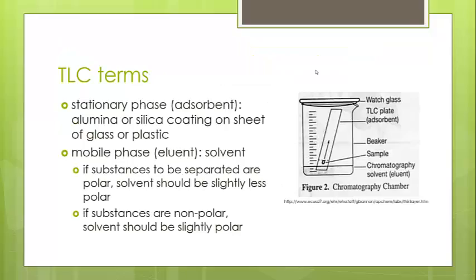These are some TLC terms. You have a stationary phase and a mobile phase. The stationary phase can be referred to as your adsorbent. This typically has an alumina or silica coating on a sheet of glass or plastic. The TLC plates we use have a silica coating.